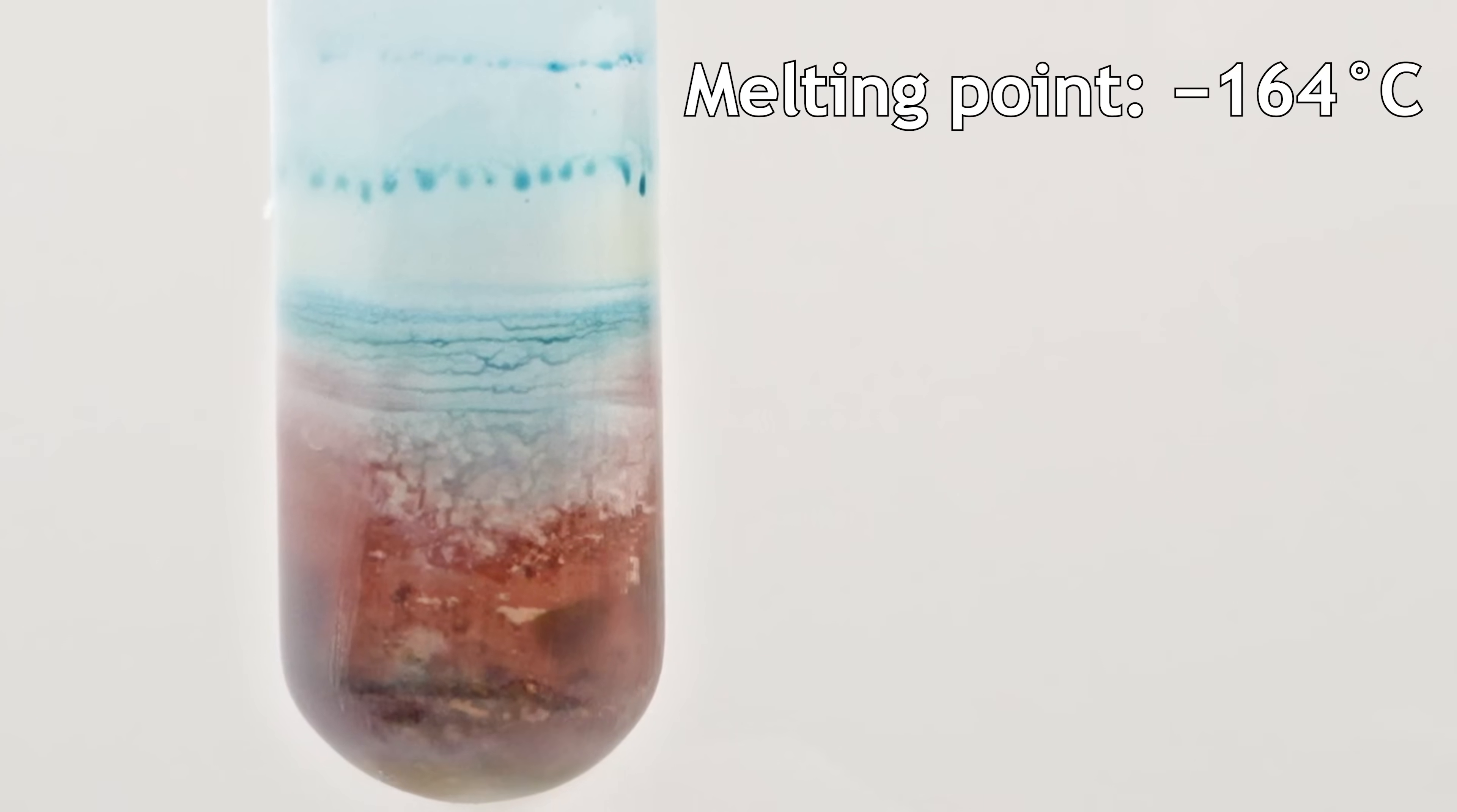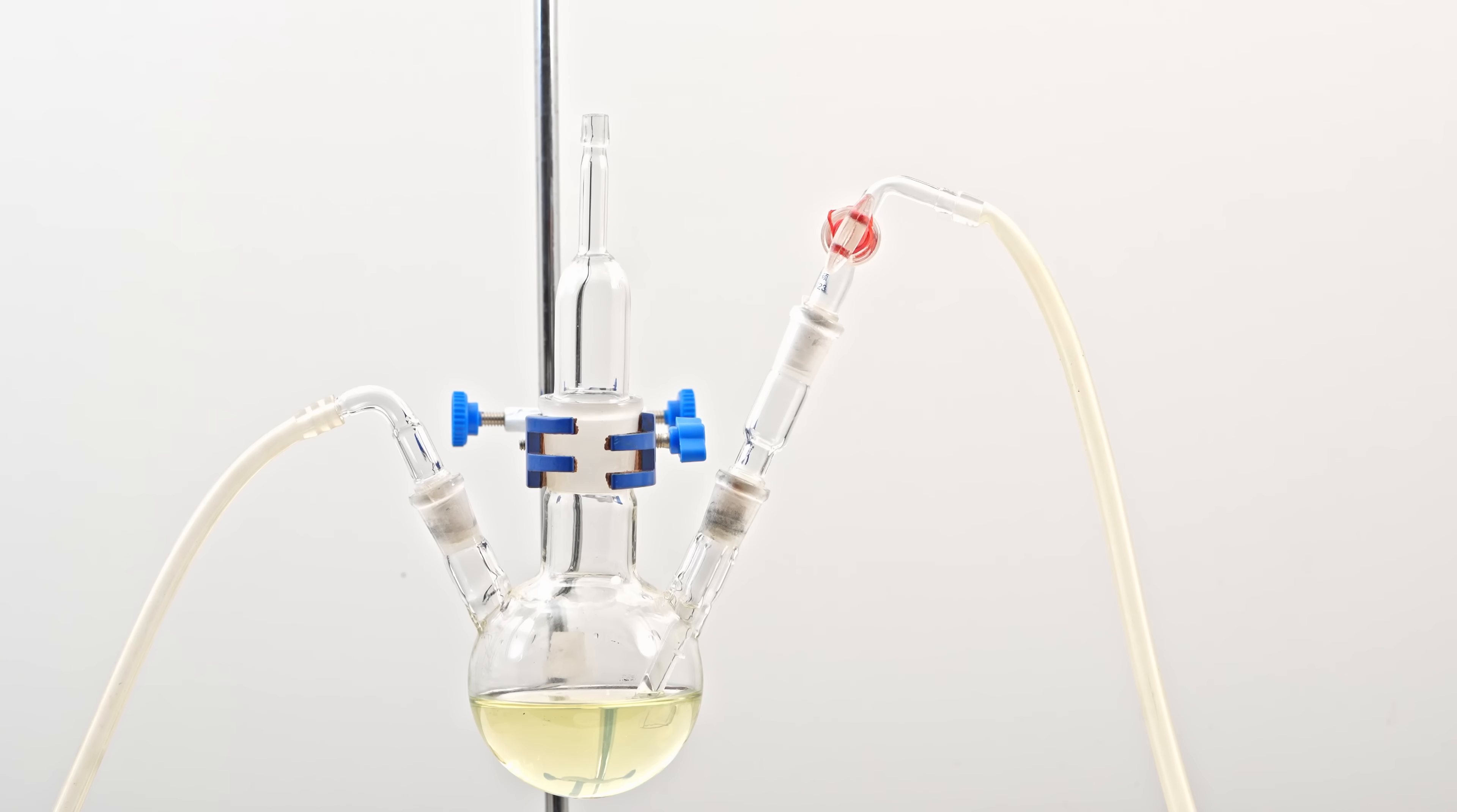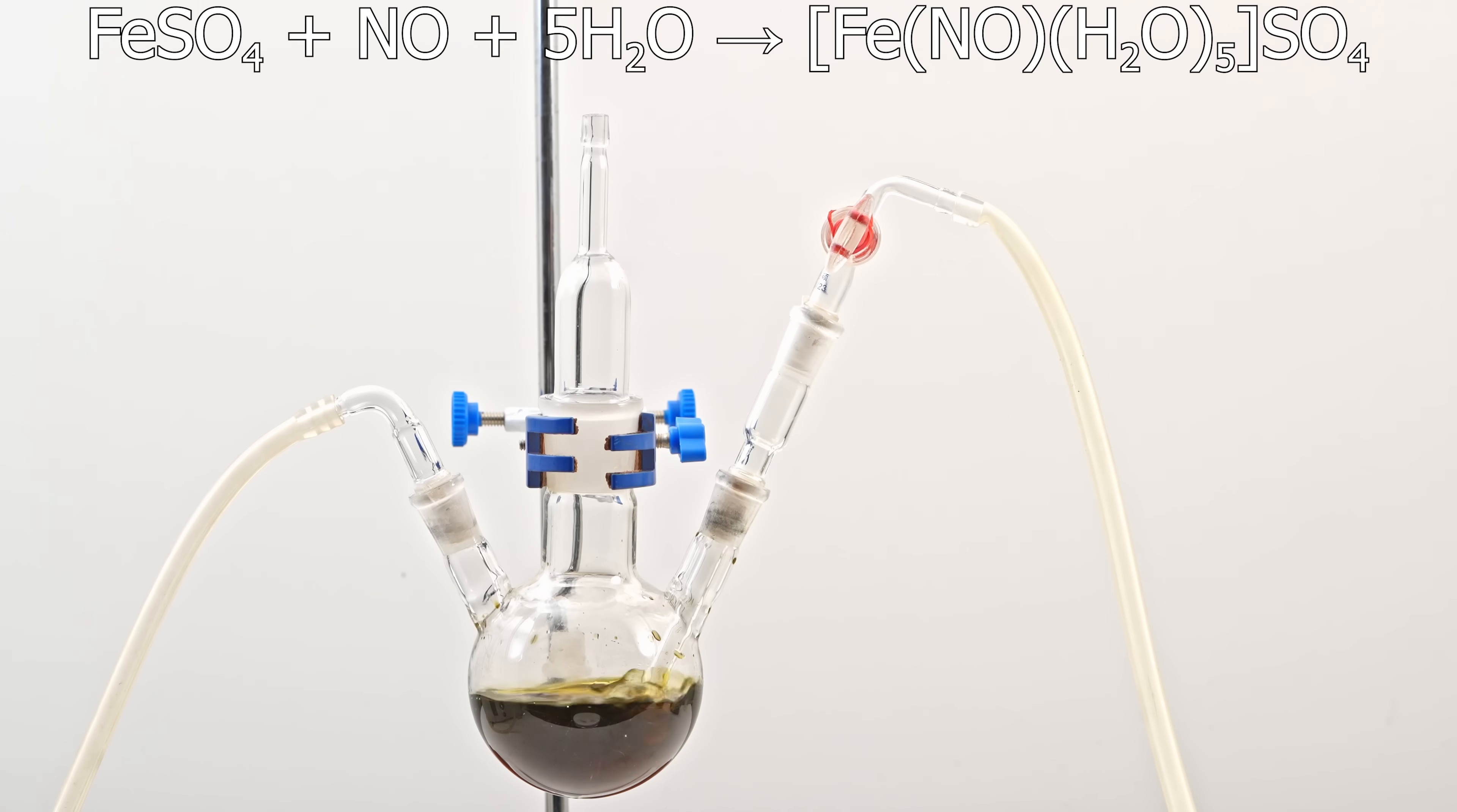The next reaction is qualitative for nitric oxide. In this three-necked flask, I've prepared a solution of iron sulfate, which oxidizes quickly in air. To prevent this, I keep an argon stream flowing through the flask. I introduced nitrogen monoxide through the right neck of the flask, bubbling it through the solution. The reaction involves aqueous iron sulfate absorbing nitrogen monoxide to form a brown nitrosyl iron sulfate solution.